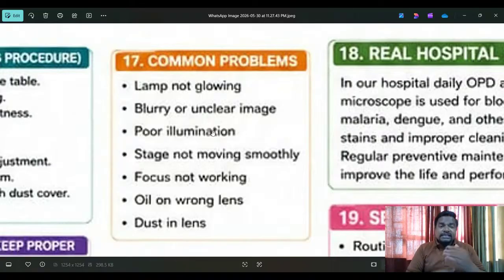Many engineers are not good, and so many user departments are also not good, because somewhere they make mistakes. That's why problems come. And every biomedical engineer should try to resolve the issues, not try to make the problem. Yes or no? Yes. Okay, come with me.